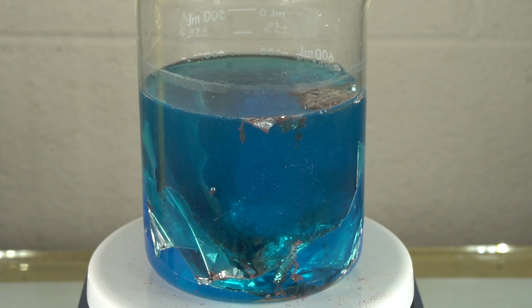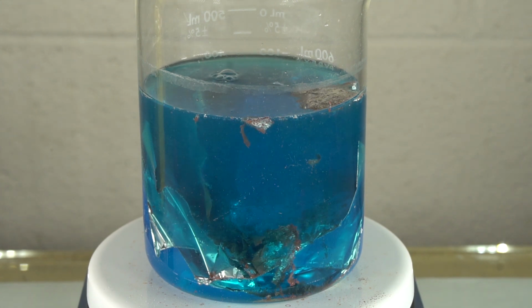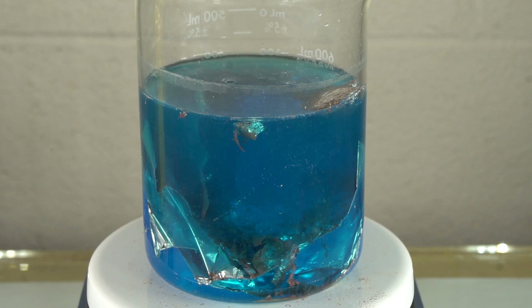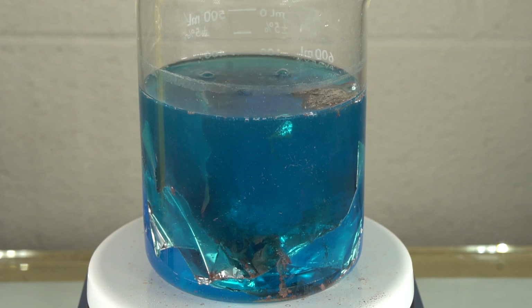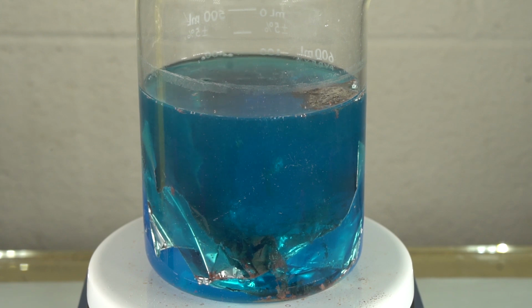There is a small amount of hydrogen being produced, and that is because as the copper ions penetrate the aluminum oxide passive layer and react with the aluminum, there's also some water getting in. And again, when water comes in contact with aluminum, it instantly creates hydrogen gas, because aluminum is a very reactive metal. Now, the amount of hydrogen we are producing is actually very small. The vast majority, I'd say 99% of the aluminum is reacting with the copper ions, not with the water. But there is a small amount, and that's why you see the gas.